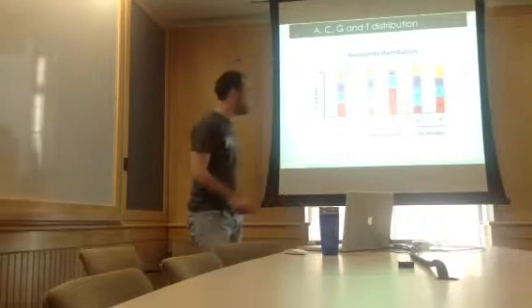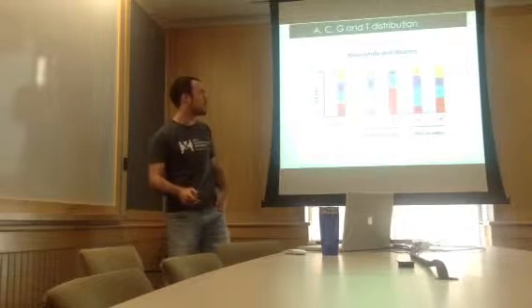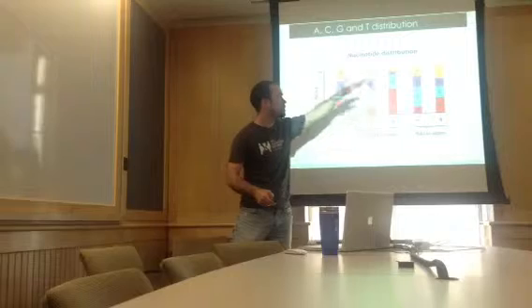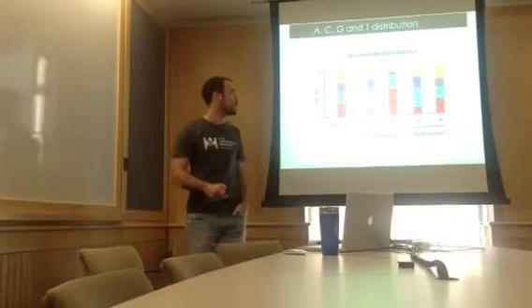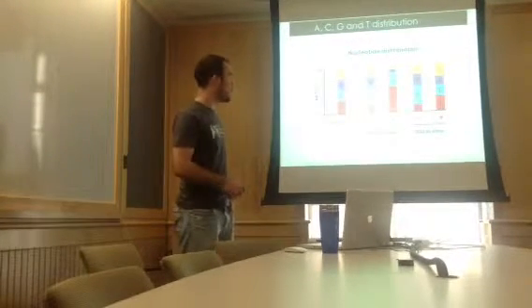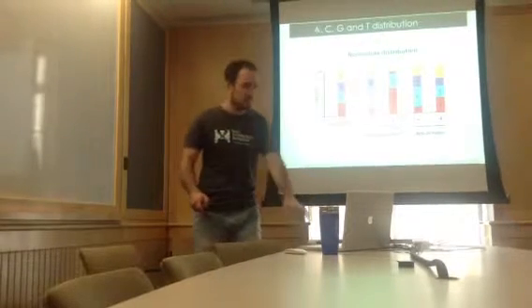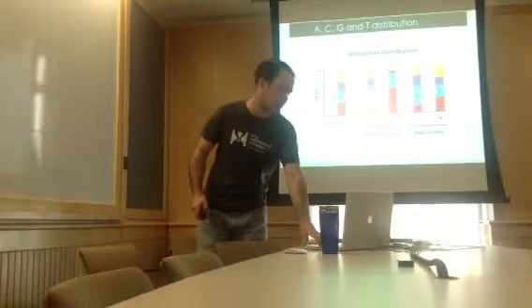While for the in vitro one, the SHAPE one, sorry, we don't see this distribution. We see a more even distribution because this compound can modify the 4 nucleotides. And just to mention that I show here only DMS in vivo, but the in vitro is the exact same thing.